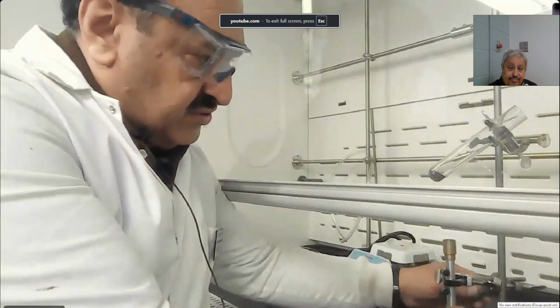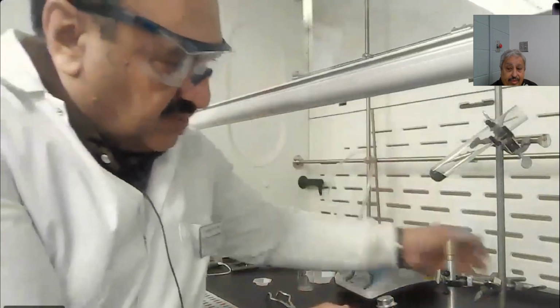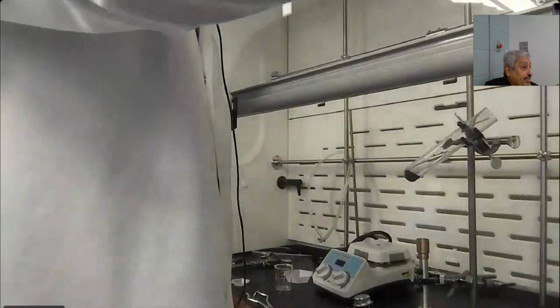At the bottom of the test tube. Make sure the top of the drain will reach the bottom of your test tube. Correct? Yeah, like this. The flame is on and he put his hand.